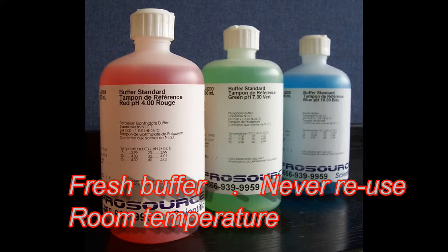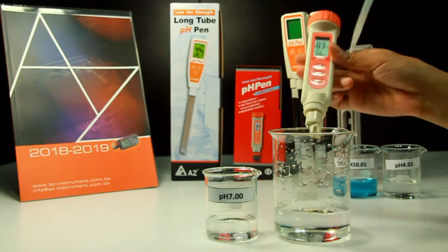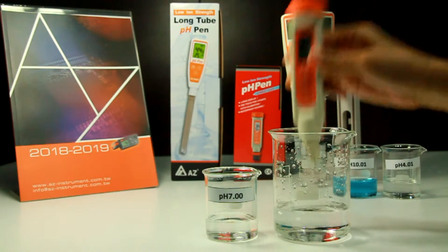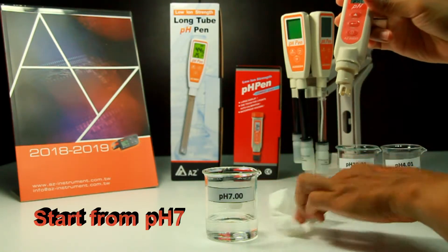It is suggested to calibrate the PH pen regularly, or calibrate it every time before testing to get the best accuracy. Two-point calibration is a must, and you can increase to 3 points if your testing range covers from acid to alkali. Always use fresh calibration buffer and never reuse it. Rinse the electrode with distilled water and blot it before immersing into calibration buffer.